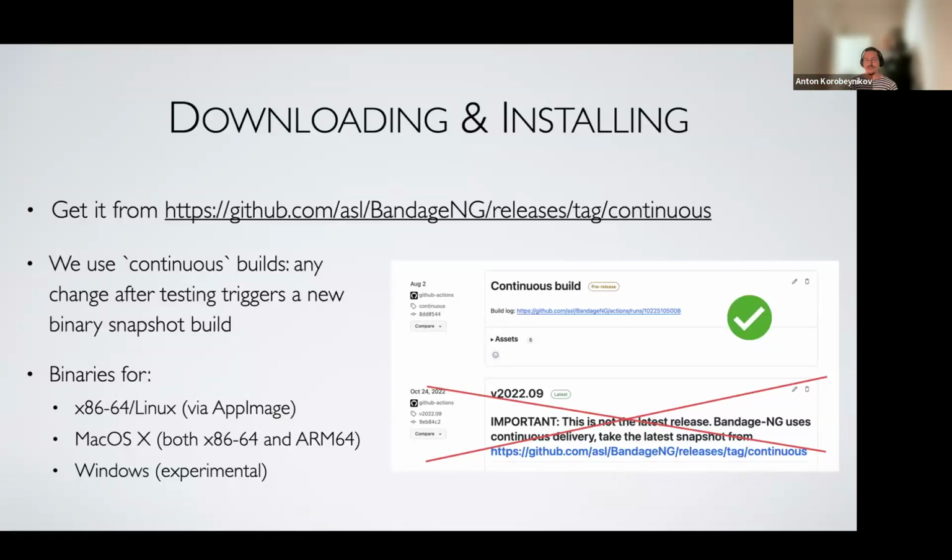So you don't have to wait for the bug fixes or other things. You could just download the latest snapshot, and you have all the features that were developed so far. This certainly complicates some things, including if you want to hard code a particular version in your scripts. Sorry for that, but I decided that it might be better, because a release is something that should be announced, etc., etc.